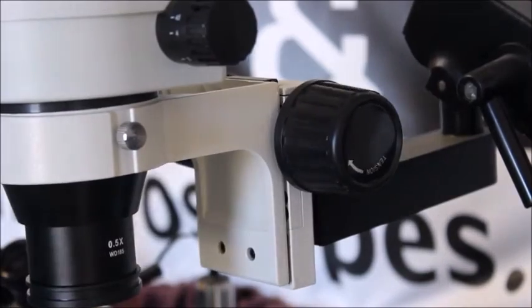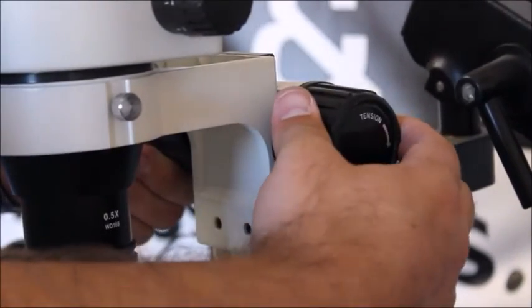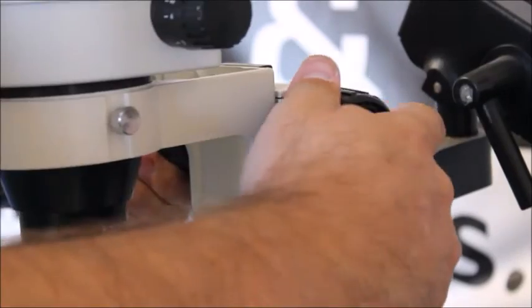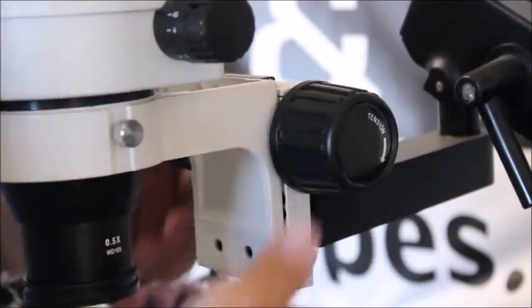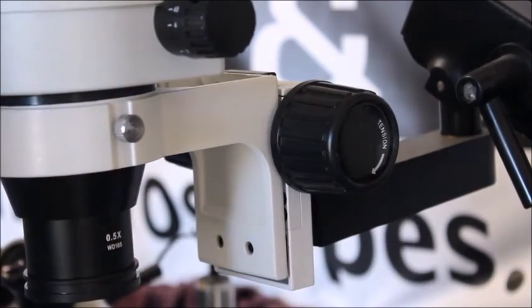Now the way you tighten this one is you're going to grab the knobs on both sides and just counter turn them. You'll feel it start to get a little bit tighter and now it stays in place.